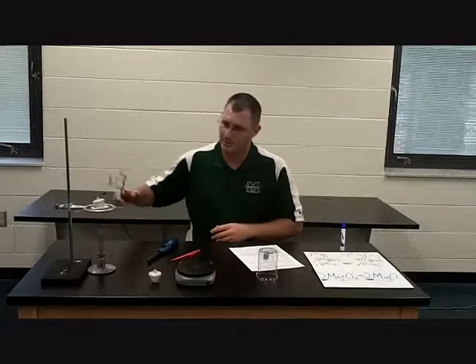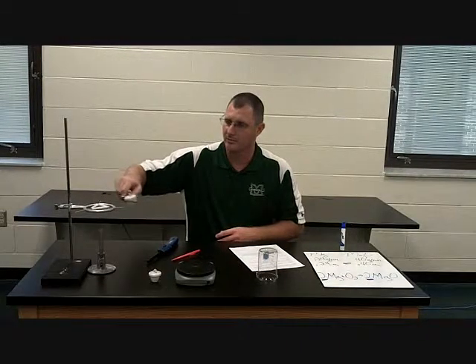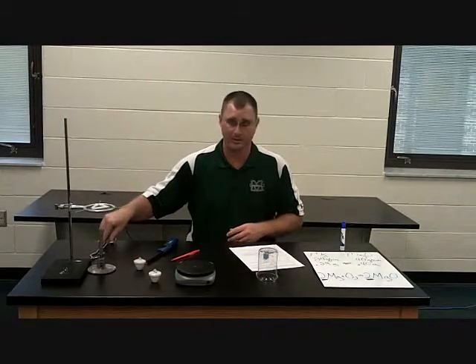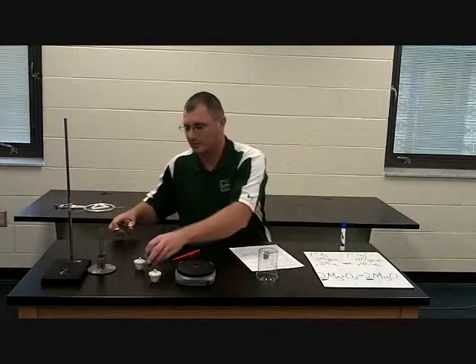And once I do that, I'm going to take it off the ring stand here, set it down. I'm going to make sure the lid's over it, and I'm going to let it cool. Once it cools so that I don't burn my scale, I'm going to take this.